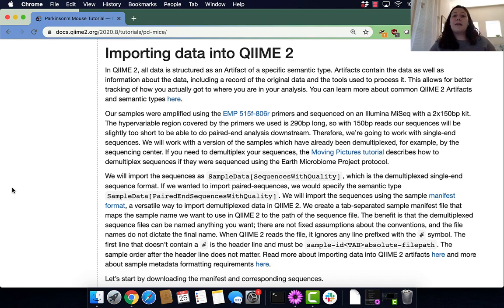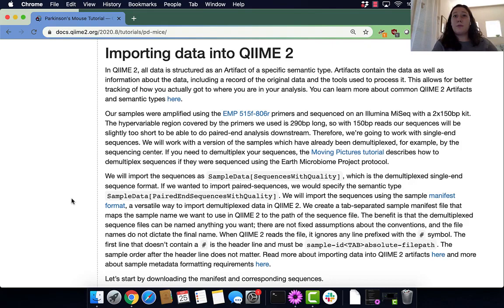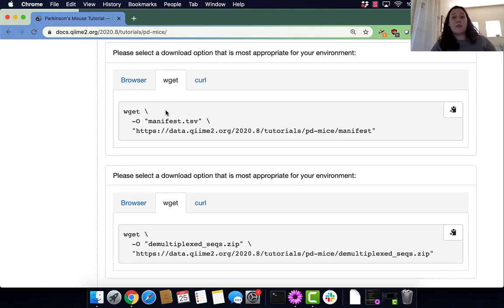Some data does not come already demultiplexed, and we have to run qiime demux in order to demultiplex it. If you want to see steps on importing and running qiime demux, I would encourage you to check out the moving pictures tutorial. Okay, so let's get into running our commands.